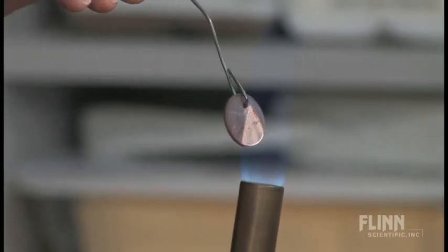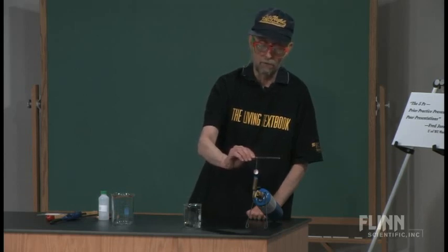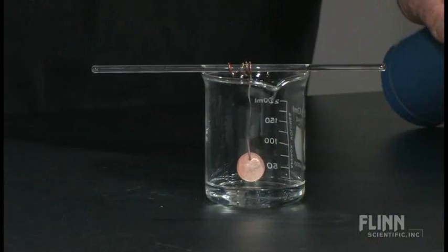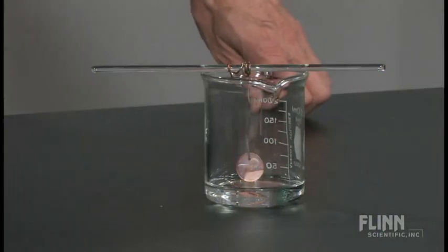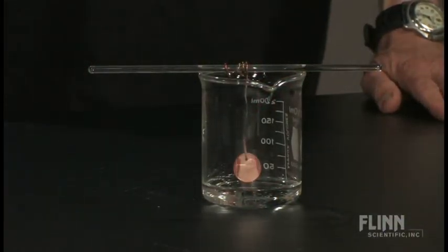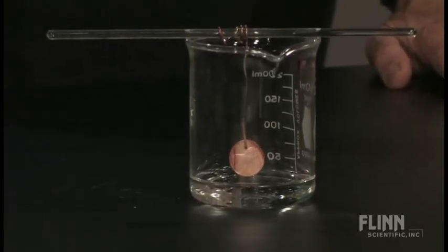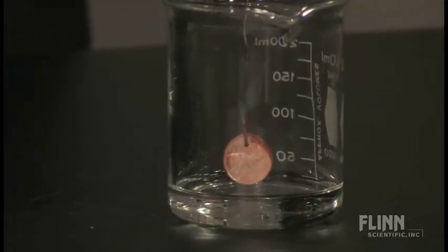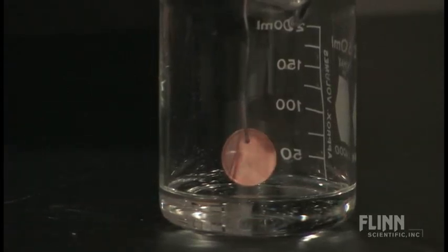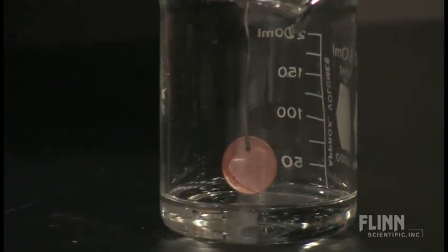Now I'm going to put it over the acetone. You can see on the monitors that it's still red — it's still glowing. What's happening on the surface: we have oxidized the copper, forming copper oxide. The copper oxide is the catalyst. We had to make the catalyst first by oxidizing the copper in air with oxygen.